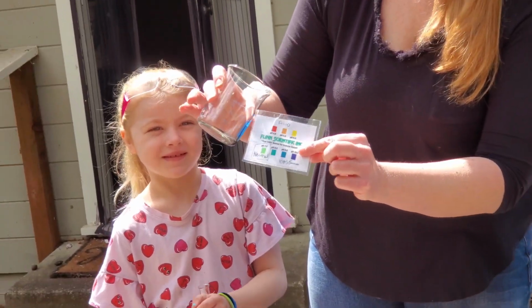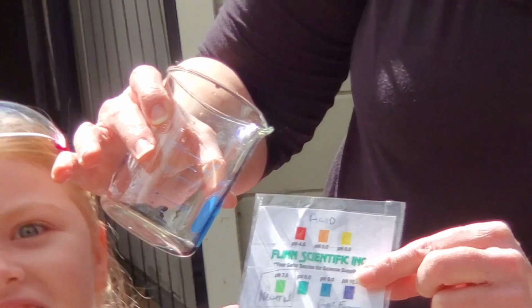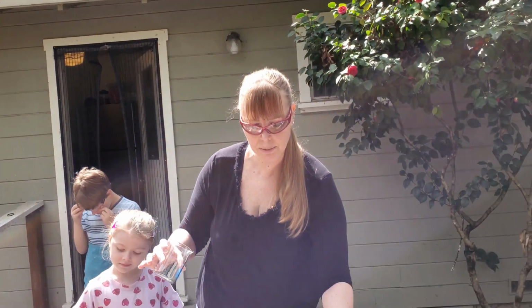Okay. So, can you guys see that? That's green. Green. Green, okay. Yeah! So now it's neutral. pH 7. What type is it? Chemical, physical?